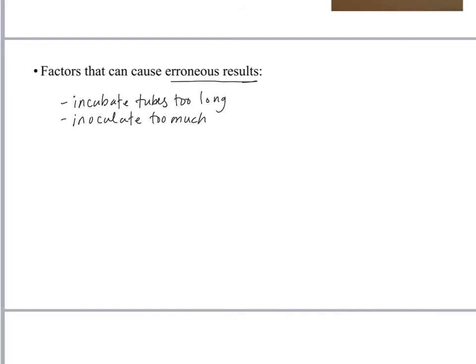It's not something you're likely to do, but say you inoculated those tubes with 4 or 5 loopfuls of your stock culture. And I didn't talk about inoculating here, but you're just going to inoculate them like you would a normal broth, either touching some growth from a plate or getting a loopful of your stock culture and swirling it around in there.